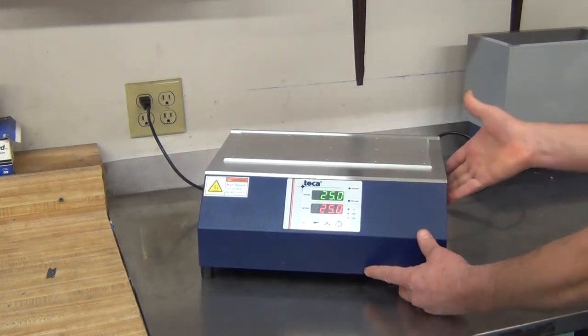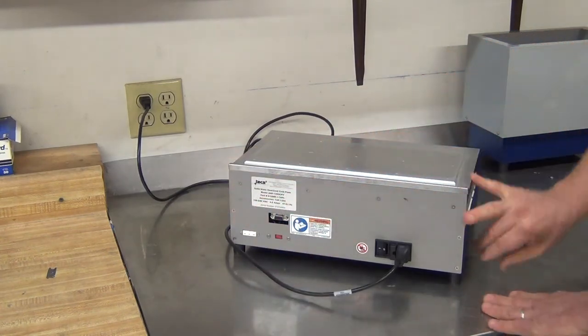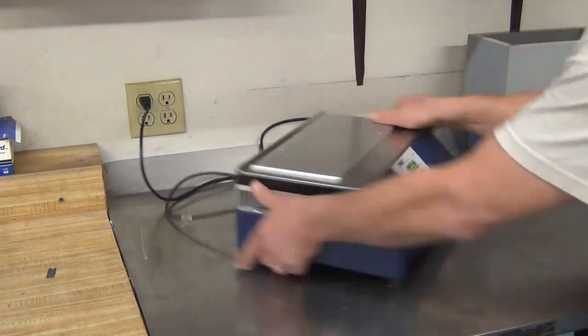Underneath, the air comes in down here, the air comes out here, and again, you have the same setup in the back for your control and your temperature measurements.